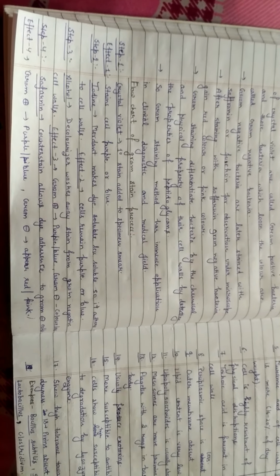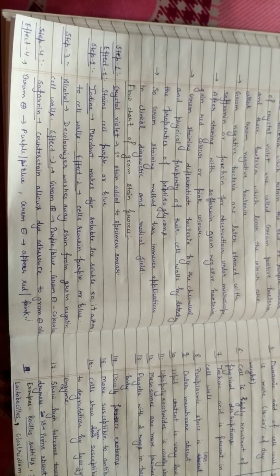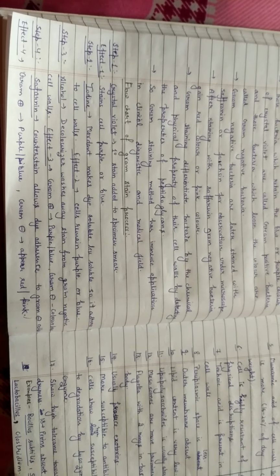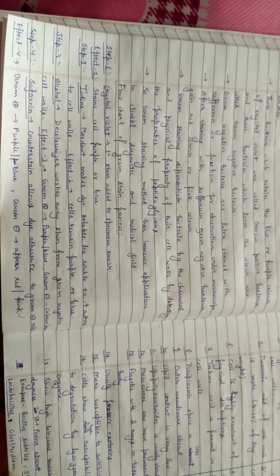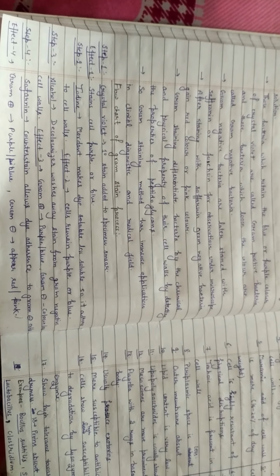But in gram-negative bacteria, the cell wall has more lipopolysaccharide, which is more soluble in alcohol. So after treatment with alcohol, the purple or bluish color in the lipopolysaccharide cell wall of gram-negative bacteria washes away.